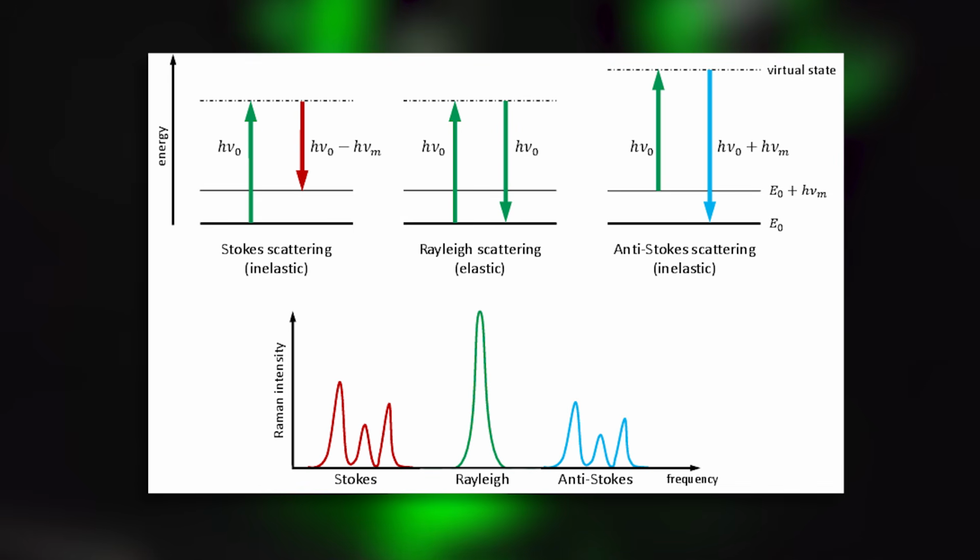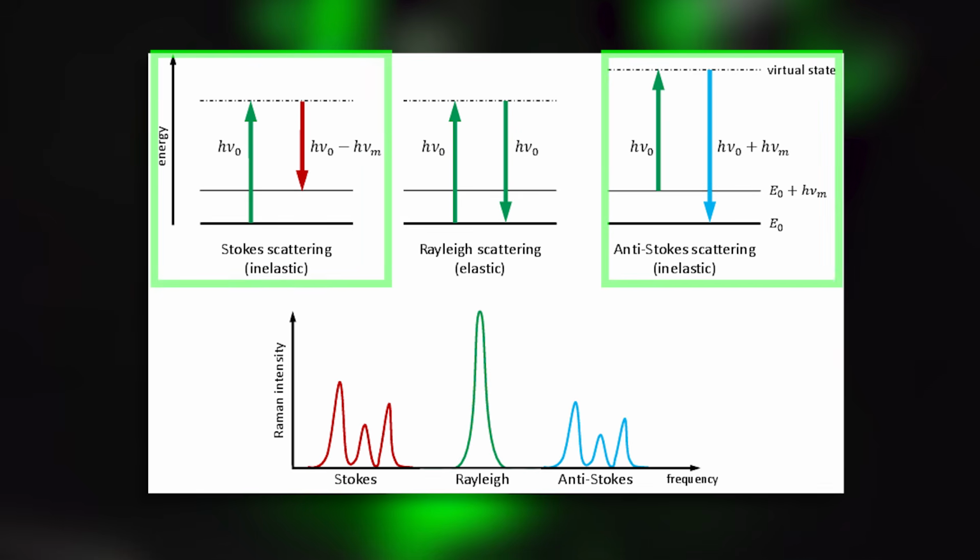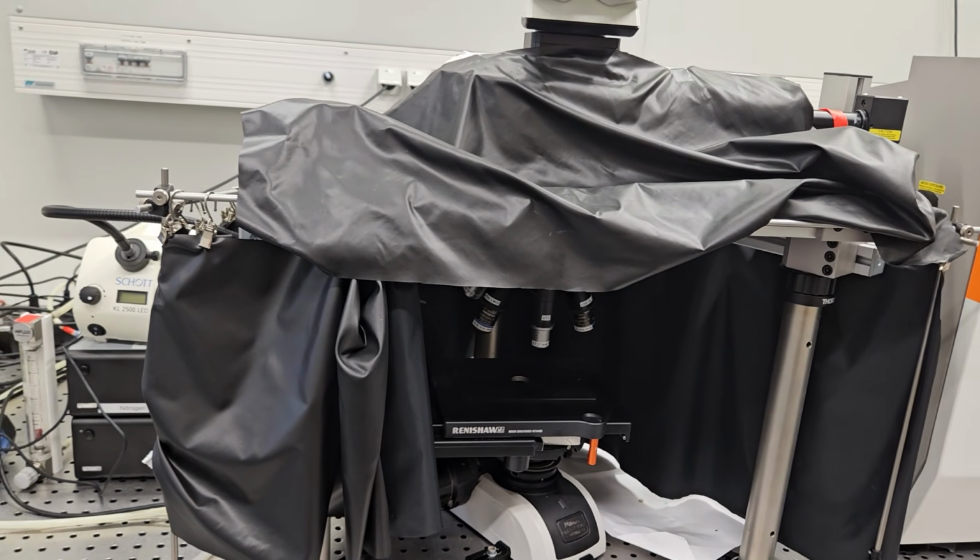With scattering, we have Rayleigh scattering and Stokes scattering. In Raman analysis, we use precisely these 2 Stokes scatterings to obtain information about the bond. With Rayleigh scattering, you don't get any information about the bond. In practice, normal Stokes scattering is used more often. Anti-Stokes is also used, but we want to take a look at the device, don't we? So now let's take a look at the device.